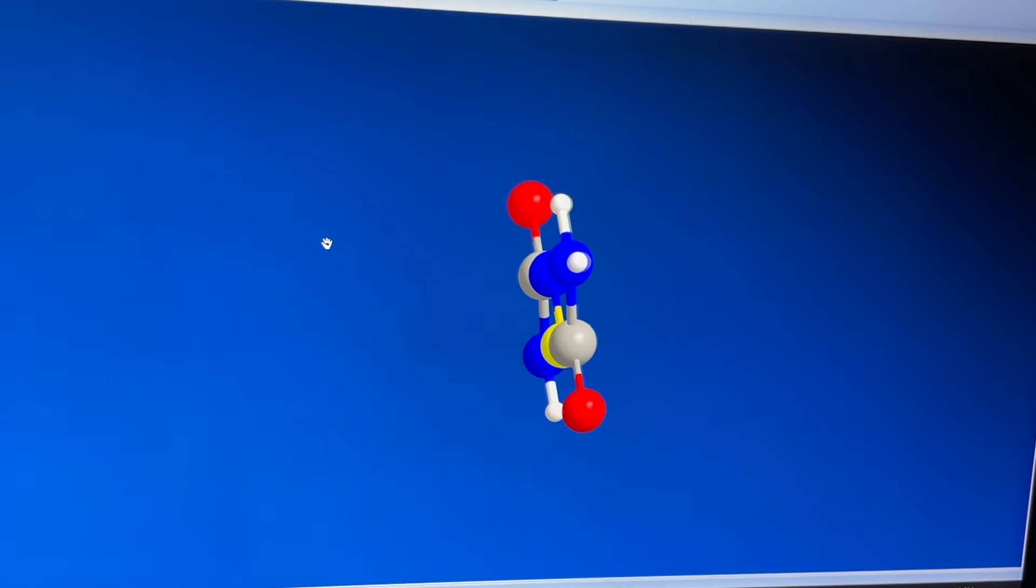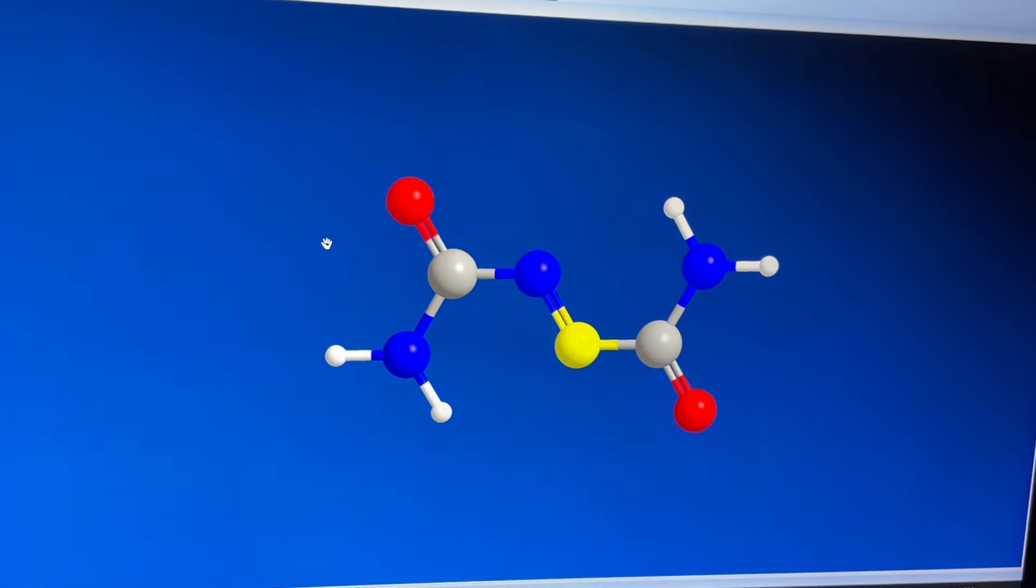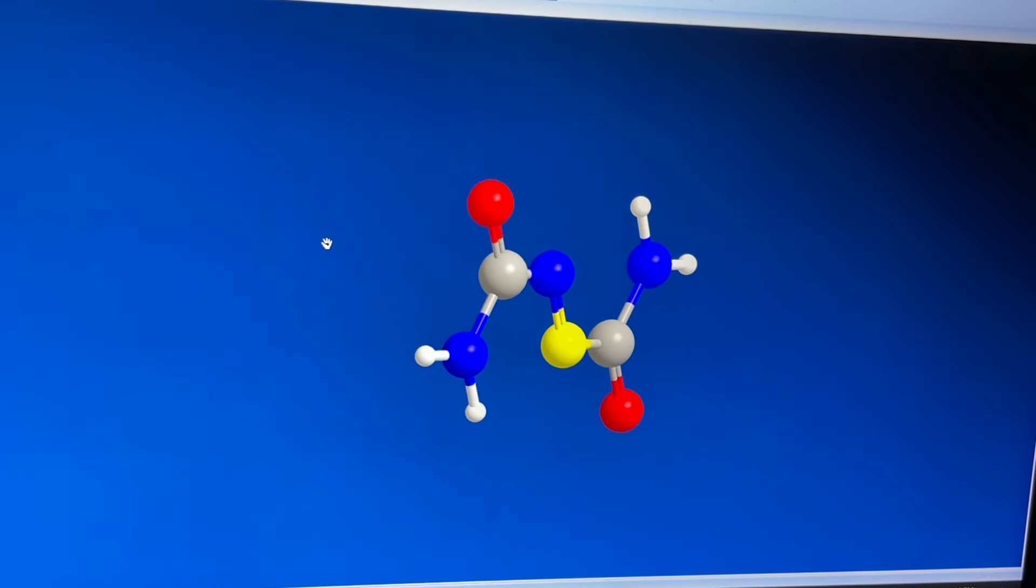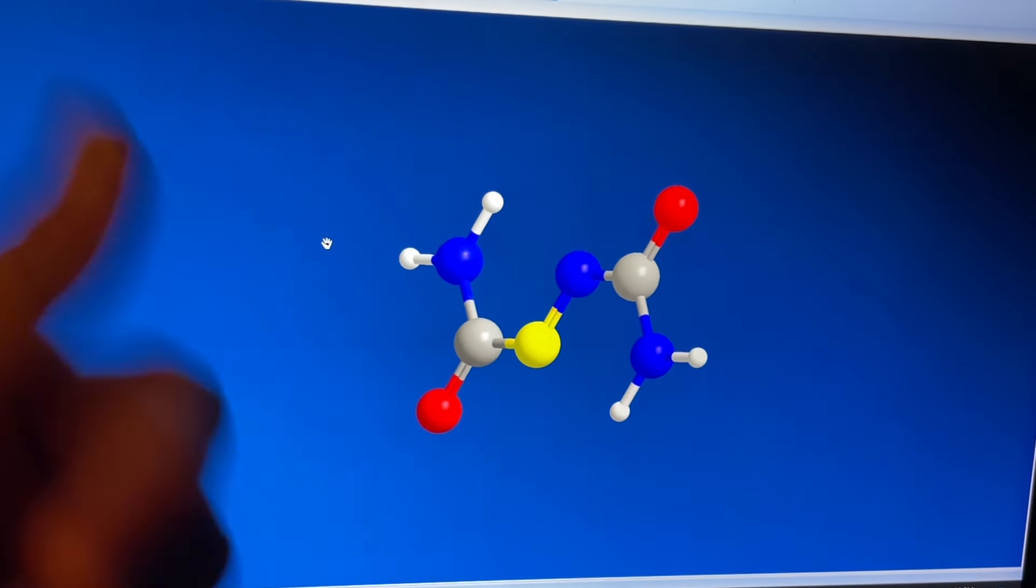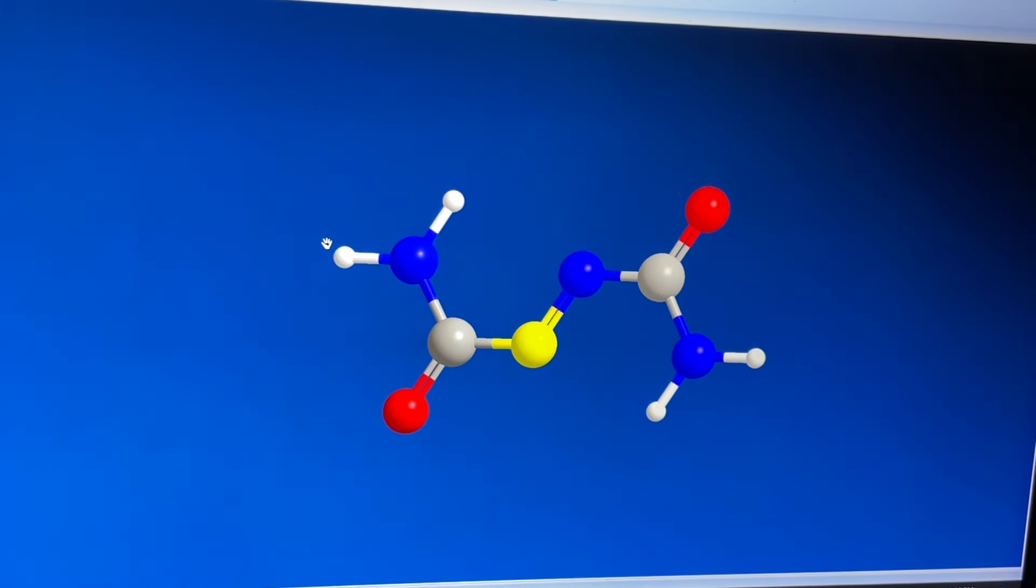This compound, it's controversial, as with every single chemical added to food. Which I think is kind of silly because not all chemicals are bad. Everything is a chemical. It just depends on the amount, of course, and the properties of it itself.